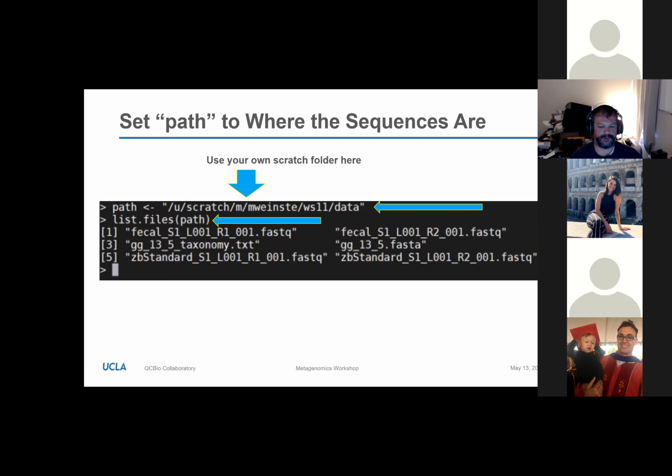So one of my big projects has been working on ways to improve microbiome reproducibility and standardization. One of the big things that I tend to do is use these standardized mock communities with known relative abundances and a mixture of tough and easy to lyse organisms. If I run that through a microbiome prep pipeline and then do the bioinformatics on it, which I've now fully automated, I can get back reports telling me exactly how accurate it looks like it was. So I can see if there were biases relative to expected.